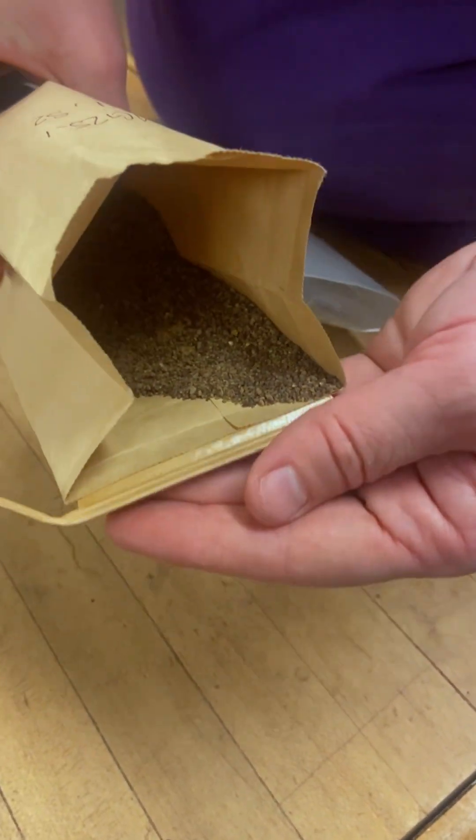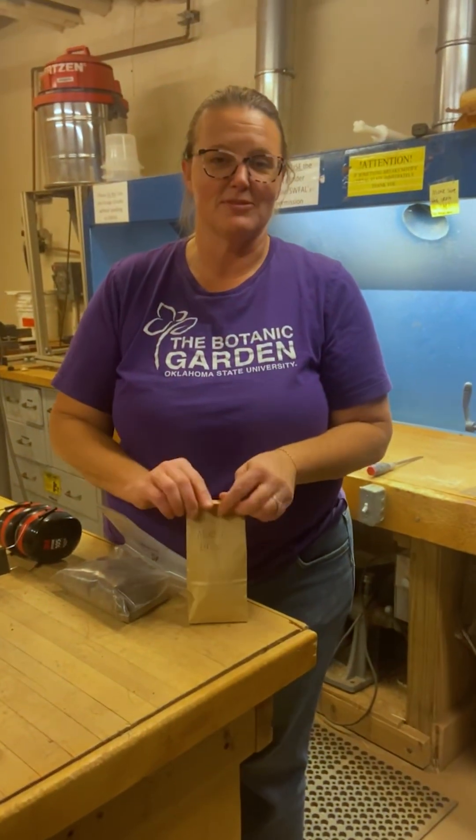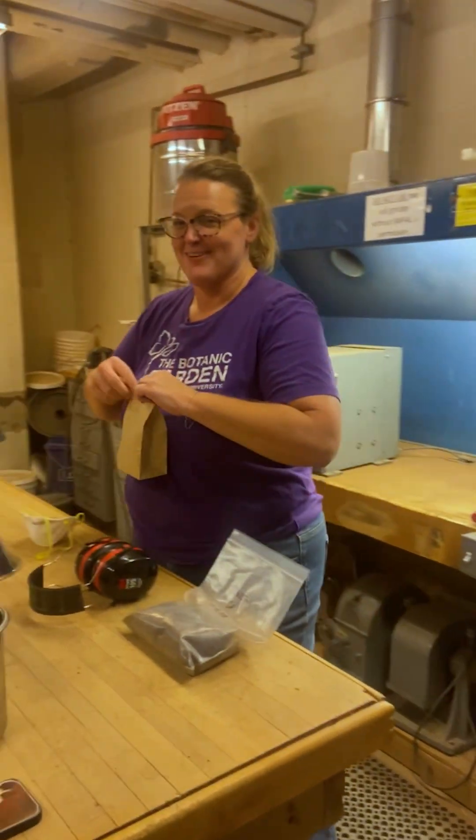You see that? That's what we're looking for. That gives us a nice homogenous sample.